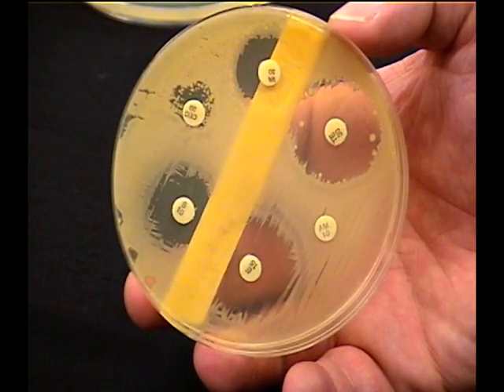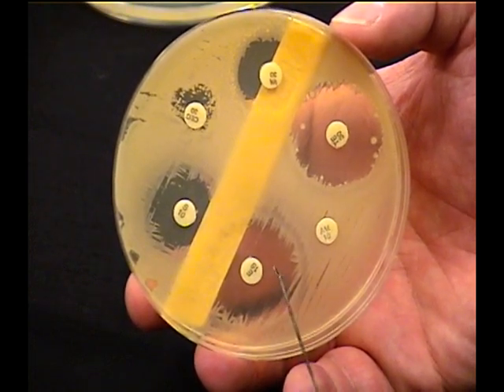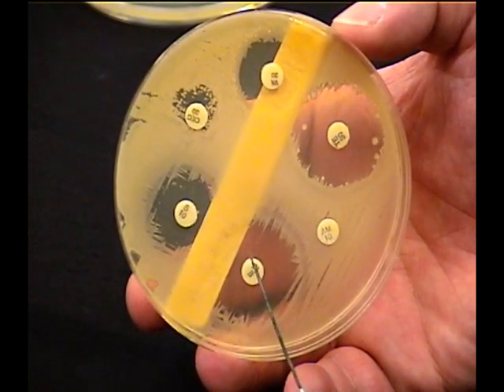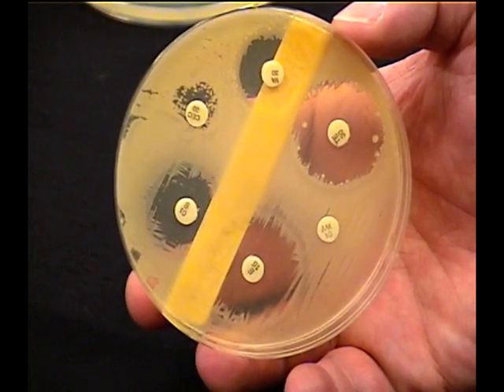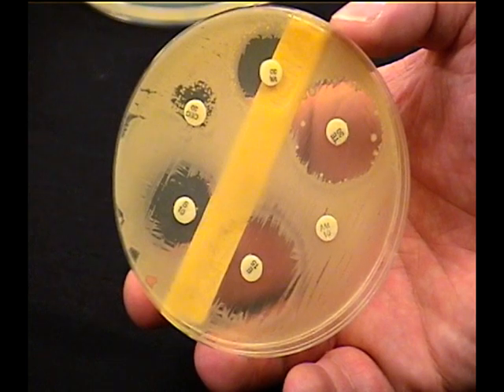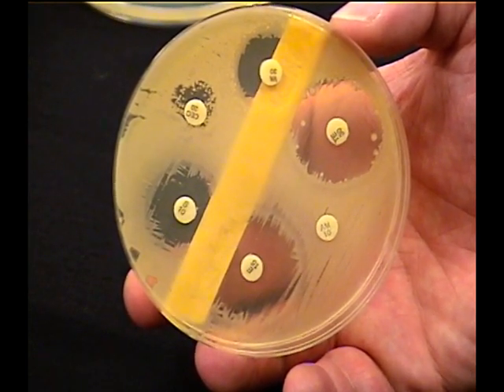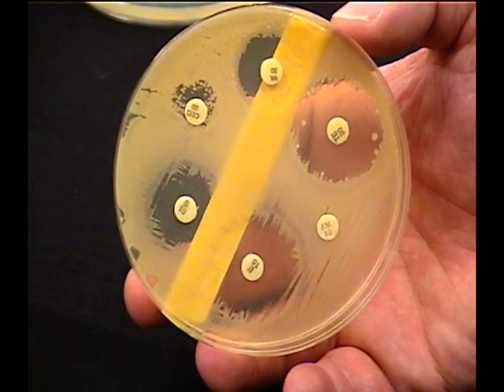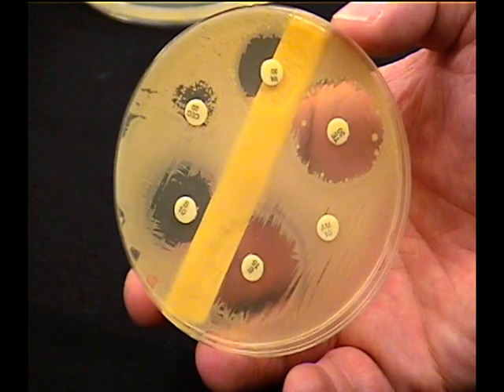But in order to determine whether the organism is resistant or sensitive, you simply measure the distance from the disc across the clear area and compare it with a table in your book that gives you what the standards are. You can determine antibiotic sensitivity or resistance to various antibiotics, same way they do it in a lab.